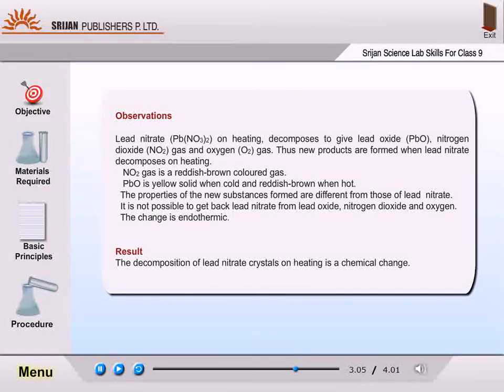Thus, new products are formed when lead nitrate decomposes on heating. Nitrogen dioxide gas is a reddish brown colored gas. Lead oxide is yellow solid when cold and reddish brown when hot. The properties of the new substances formed are different from those of lead nitrate.